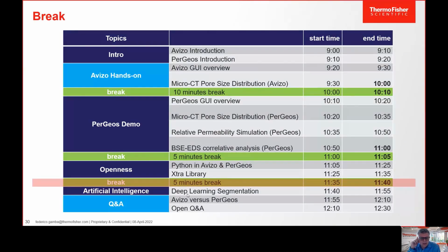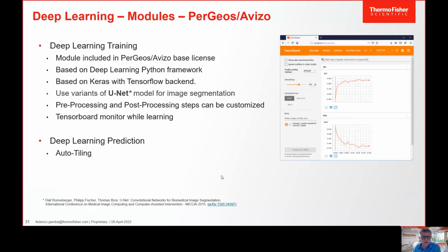So we have done some work on it. Still, deep learning requires a data scientist, I think. So you need to know about deep learning. We have done the tool to let you do deep learning without coding anything. But still, if you don't know anything about data science, then you will be a little bit in trouble, I think, to do deep learning.